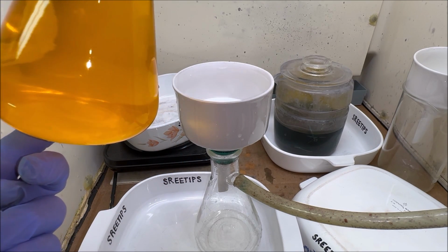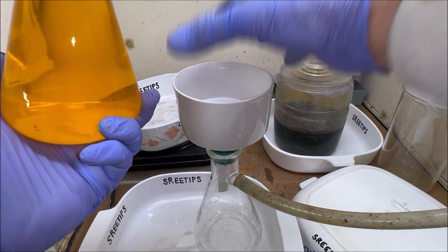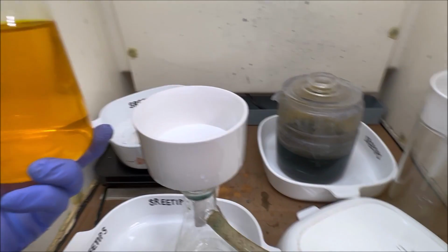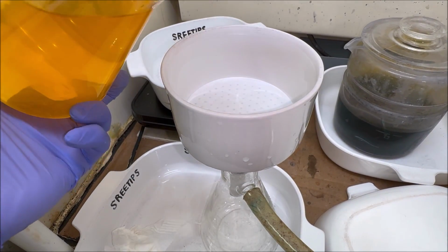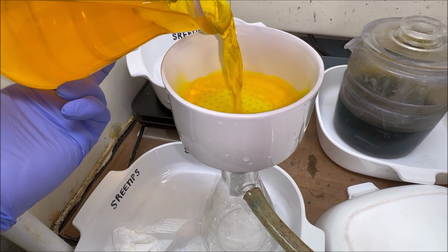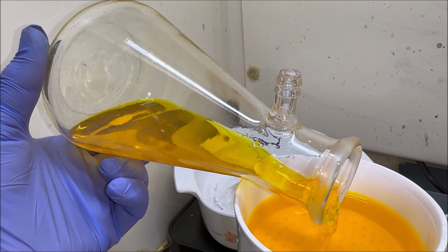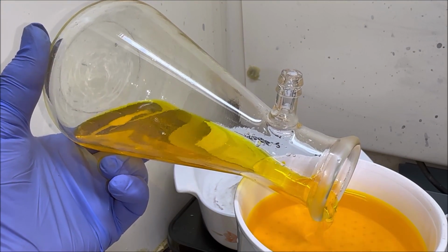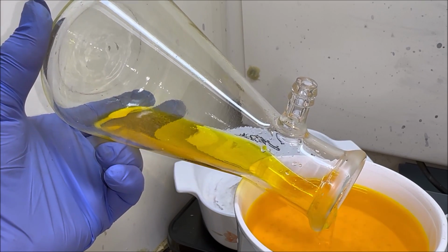I don't see anything new. There's definitely some junk down in the bottom here that we need to filter out, so that's what we're going to do right now. Yeah, there's quite a bit of precipitate down in the bottom of this flask. Probably going to be lead sulfate.